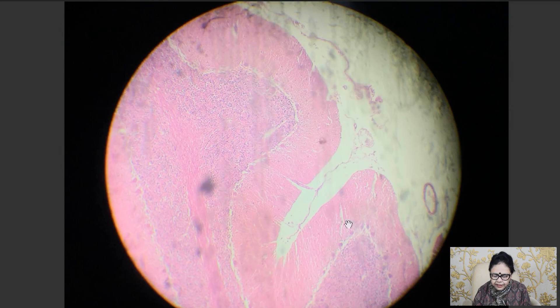So this is a single folium, and this is another folium. In between the two folia, there is a deep fissure.